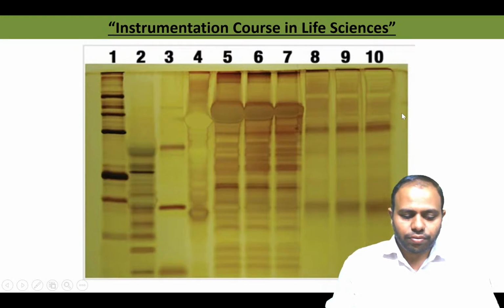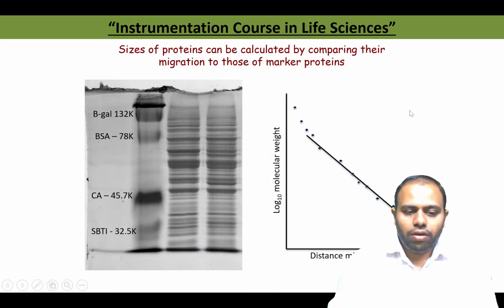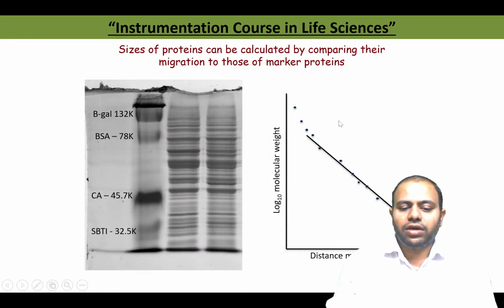You can use it for determining the molecular weight also. You use a ladder of known molecular weight, and then the unknown sample's molecular size can be determined using a graphical method, just like we do in estimation of different components.